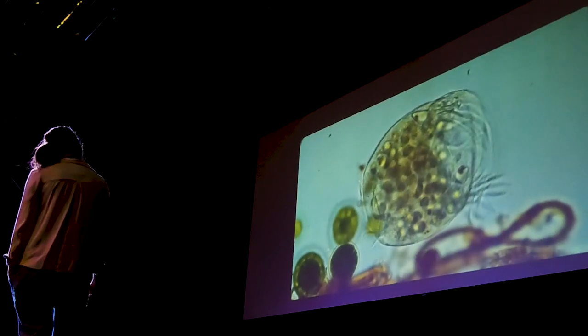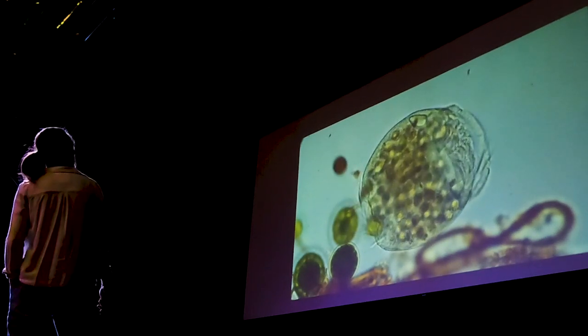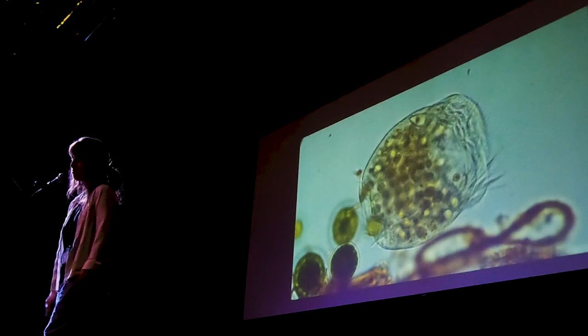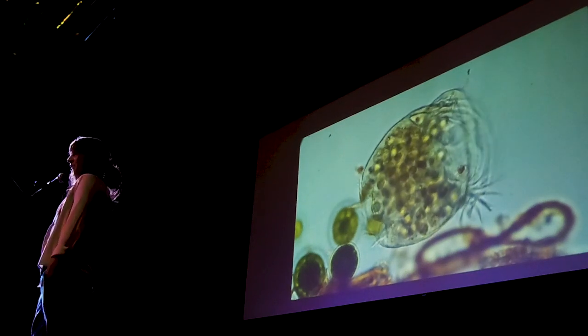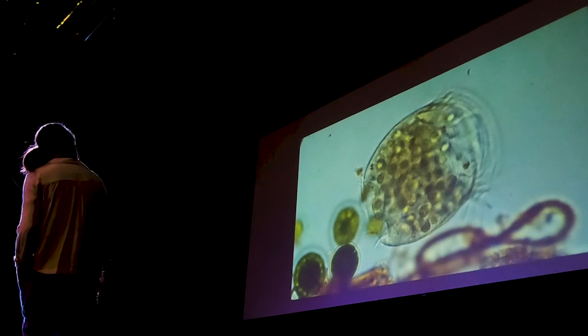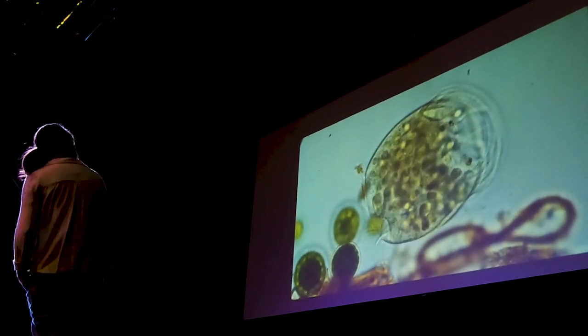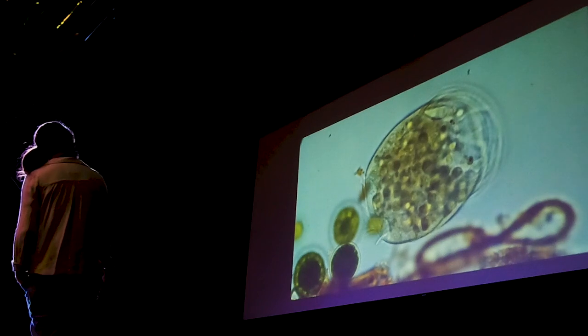This is another little beauty. Those little balls that you see bubbling around, those are algae. This guy's getting ready to set off its vortex so that it can force all the organisms around it to fall into its mouth. And you can see inside its tummy there were some unfortunate creatures, a lot of them. I think this is a ciliate, but I really don't know.